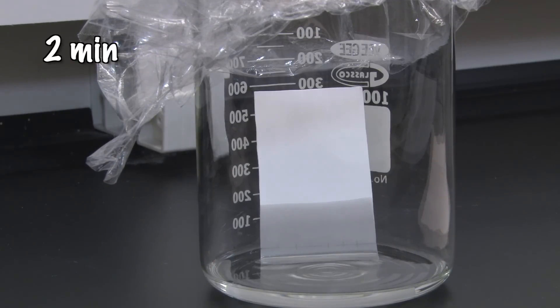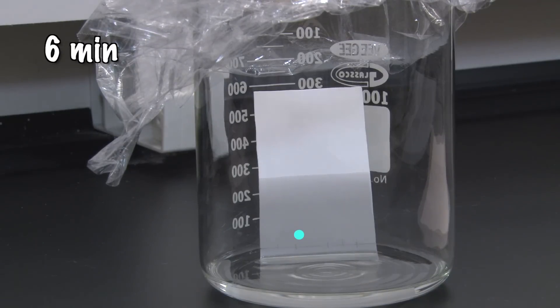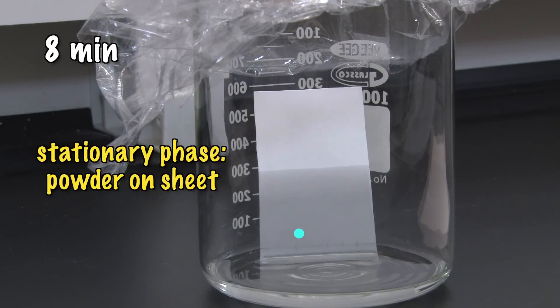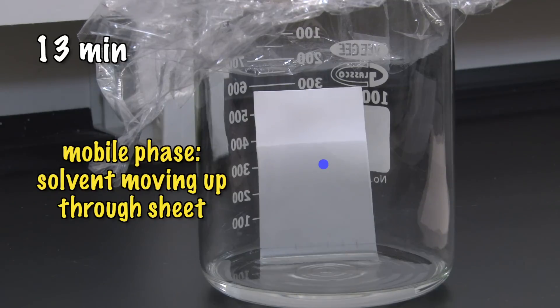The solvent will slowly wick up through the sheet, carrying the applied samples along with it, but different substances climb the sheet at different rates. Some substances are more attracted to the stationary phase, the powder on the sheet, so they'll travel slowly. Some are more attracted to the mobile phase, the solvent, so they'll travel more quickly.